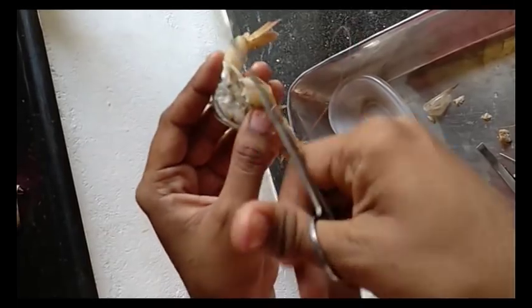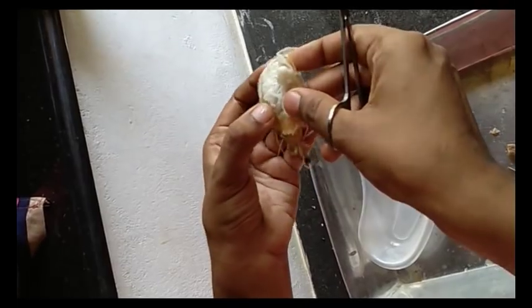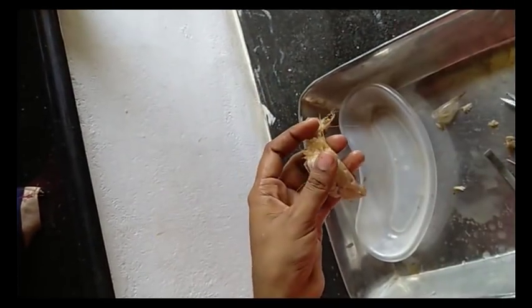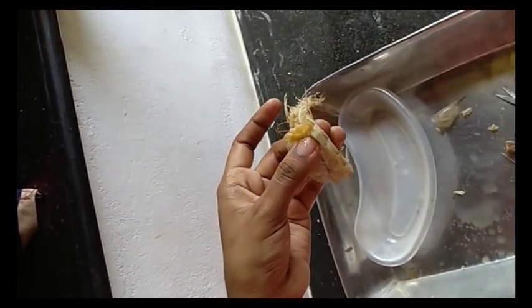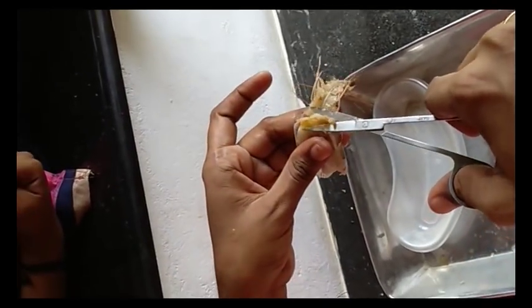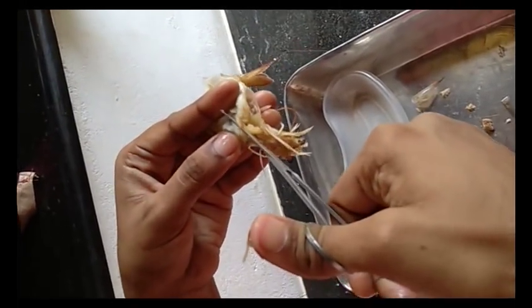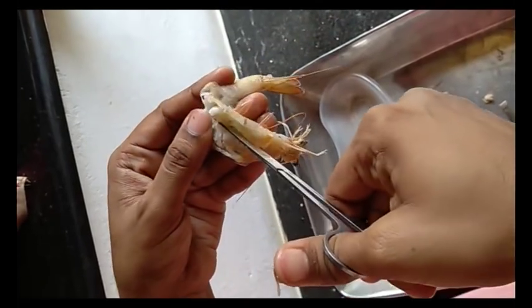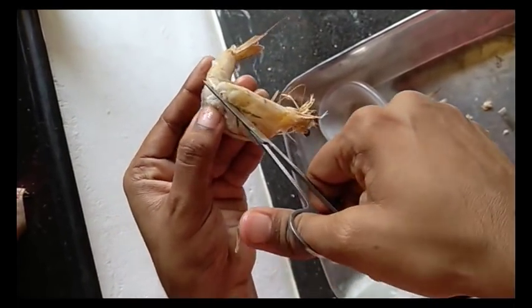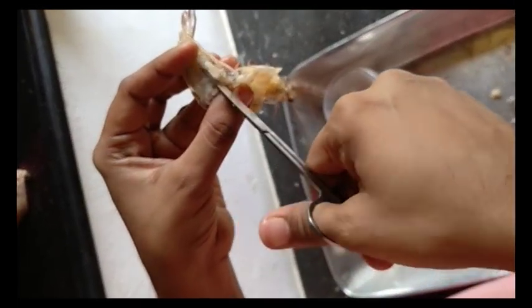Make a cut through the flexor muscles in order to reveal the nerve cord, the ventral nerve cord. So it's way down, ventral nerve cord. See? You need to trace it down like this. Cut through it. You may use a blade, but take care not to cut the nerve. It's not a very clean cut that I made.